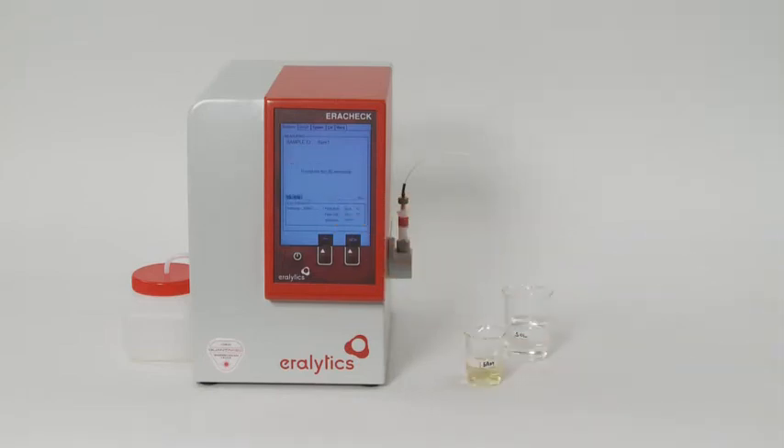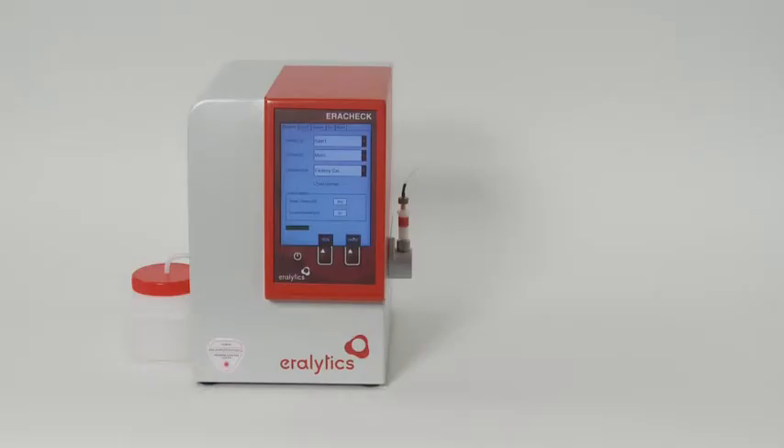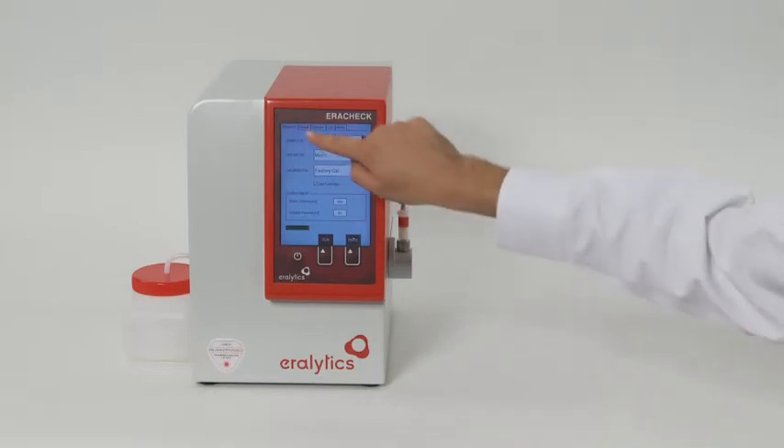Then push Run and follow the instructions of the automated measuring procedure. The analysis is finished within three minutes. The displayed result is the concentration of total petroleum hydrocarbons in water, measured in milligrams per litre.